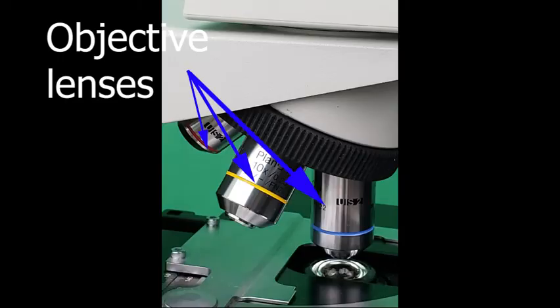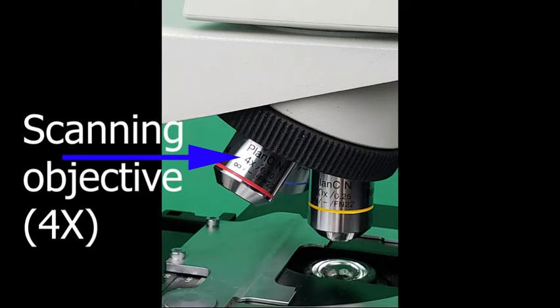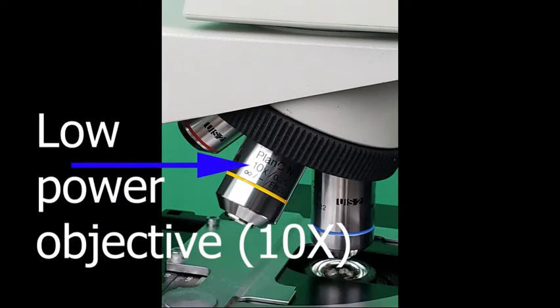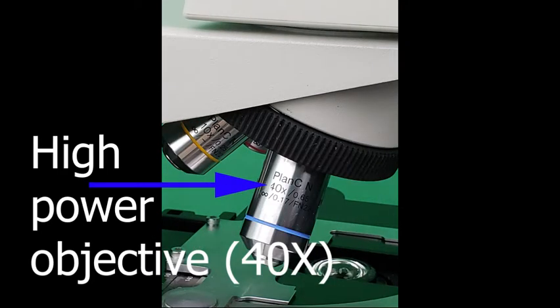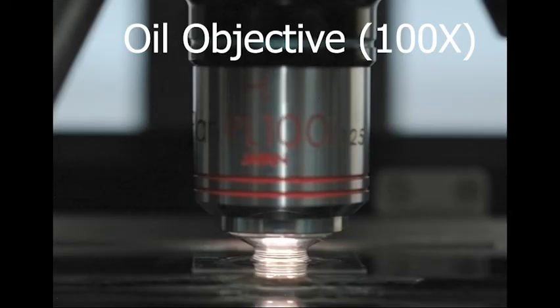Objective lenses: Three to four objective lenses are usually attached to the nosepiece with different magnification written on each lens. The shortest of these lenses is the scanning objective or 4x for quickly surveying the whole area of the microscope field. The mid-sized one is the low power objective or 10x. The longest one is the high power objective or 40x. Some microscopes may have an oil objective which requires oil to observe the specimen. The oil objective is usually 100x.